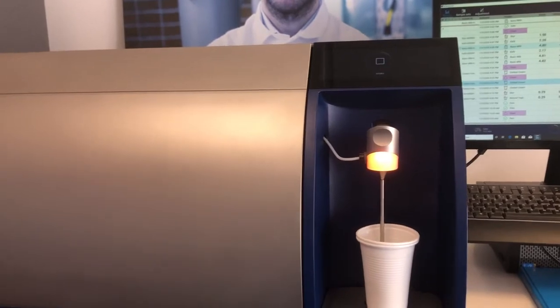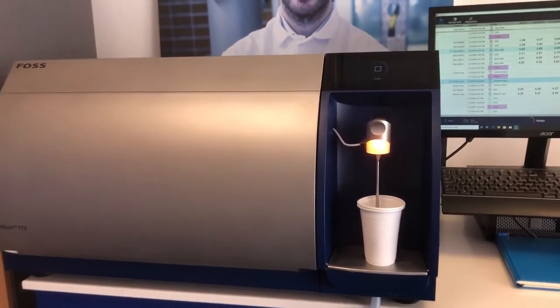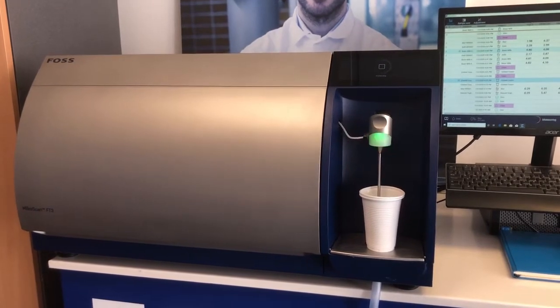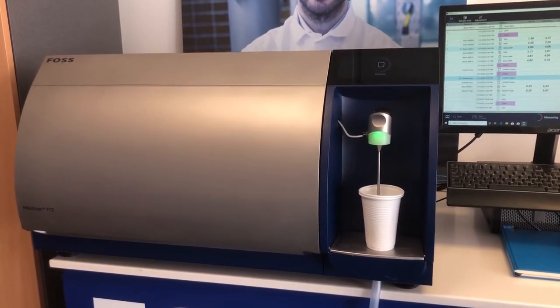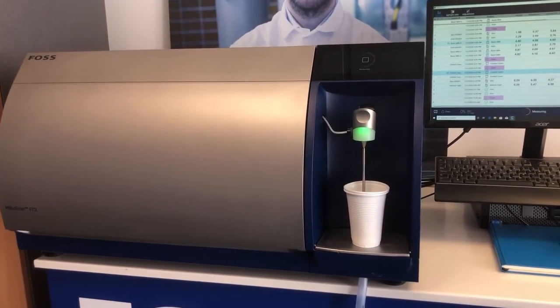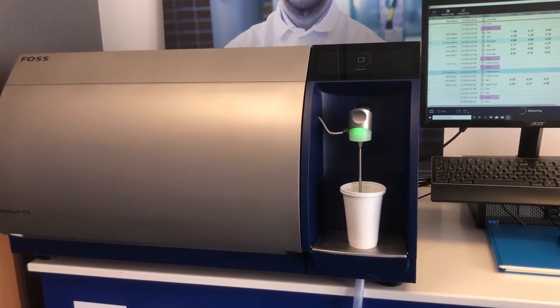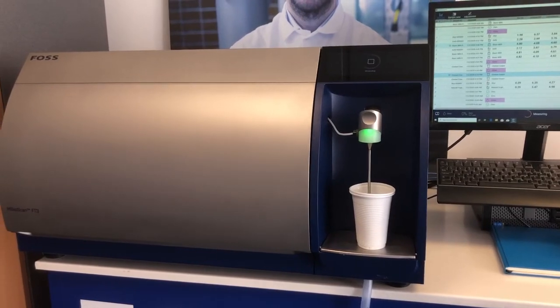The new FT3 doesn't have a homogeniser or high pressure pump, so it's always standardised. We no longer need to standardise and equalise, so the instrument doesn't drift, and it also lets us run this wide range of samples without any issues.